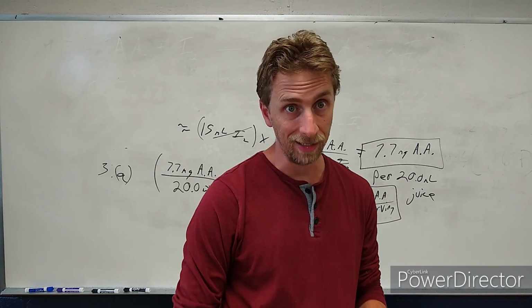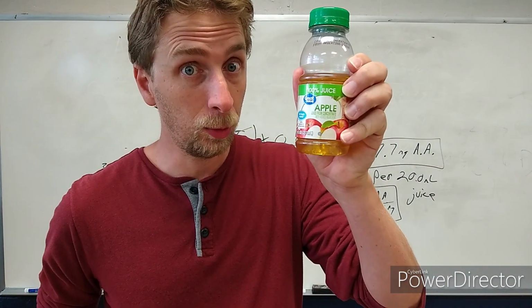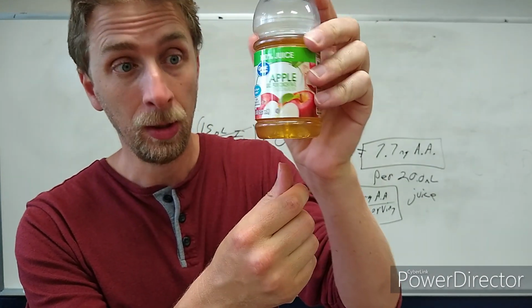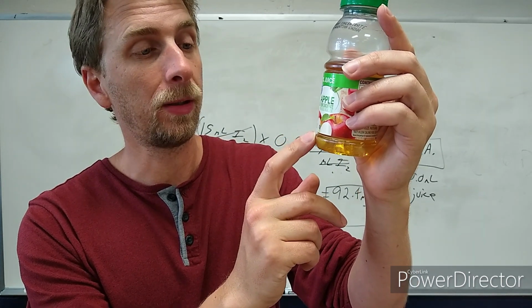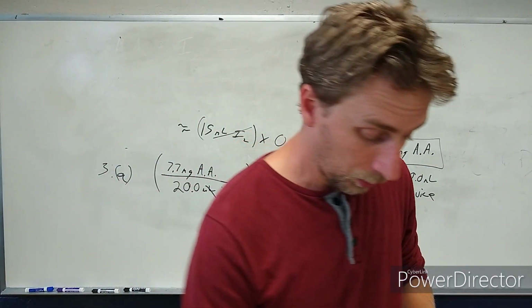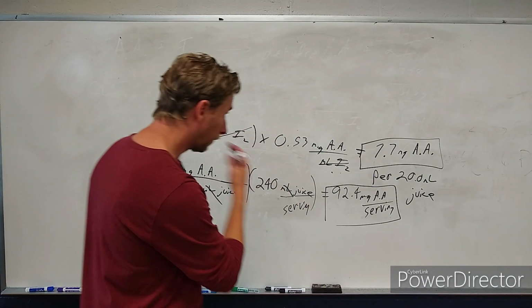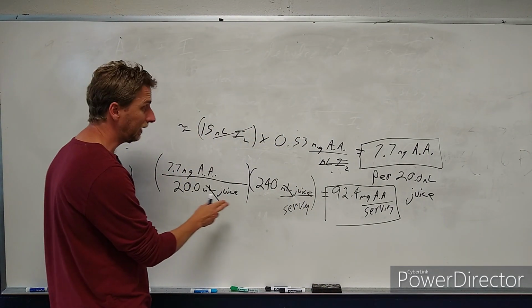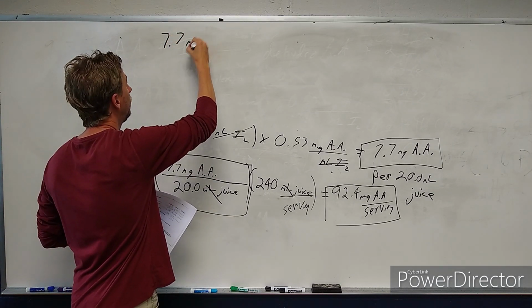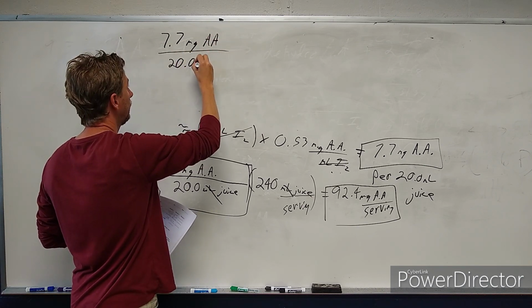Okay, and the bottle is not 240 milliliters, but it is close enough. It says it's 237 milliliters per bottle, 8 fluid ounces, and again, 130% daily recommended value. So how are we going to say whether or not our results support the claim on the label? Well, if our results from the experiment was this right here, we could use it like this. Say, okay, I got 7.7 milligrams of ascorbic acid per 20 milliliters of juice. I'm going to write that again up here.